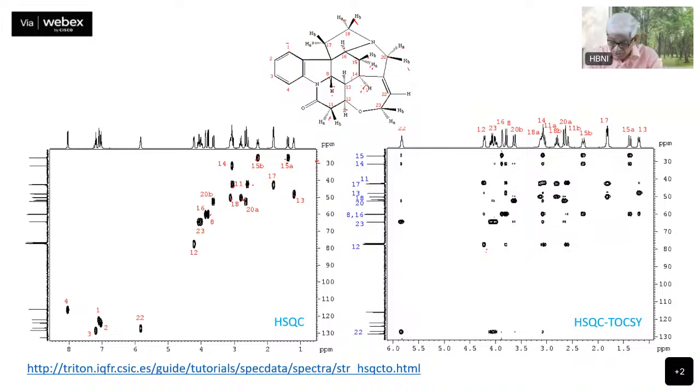And this one is what? This is 22. 22 is showing to 23. 23 is here, and the other carbon is not labeled. I think we connected to that also. 22 is this. 22 is connected to 23. And this carbon is the quaternary one. There is nothing there. Nothing important, right. So 23, and then you have this one here.